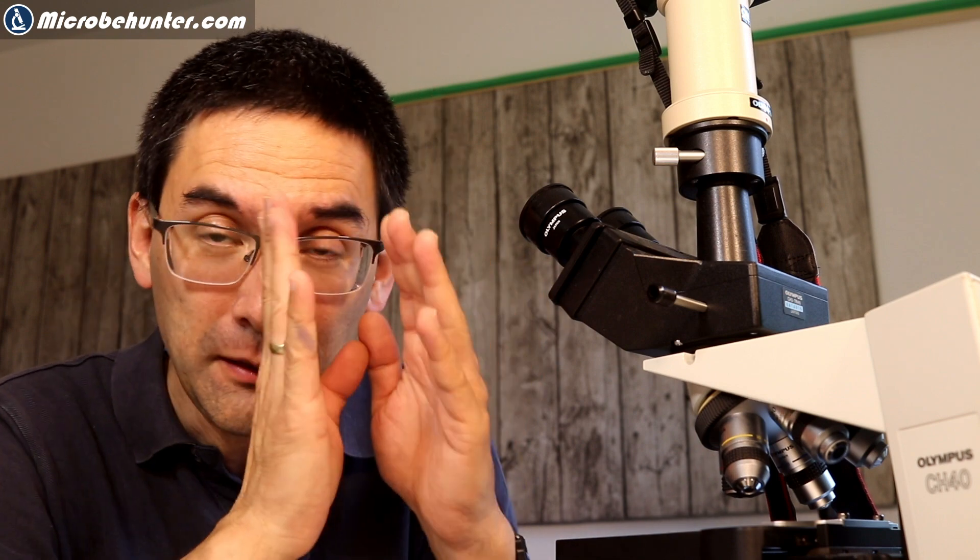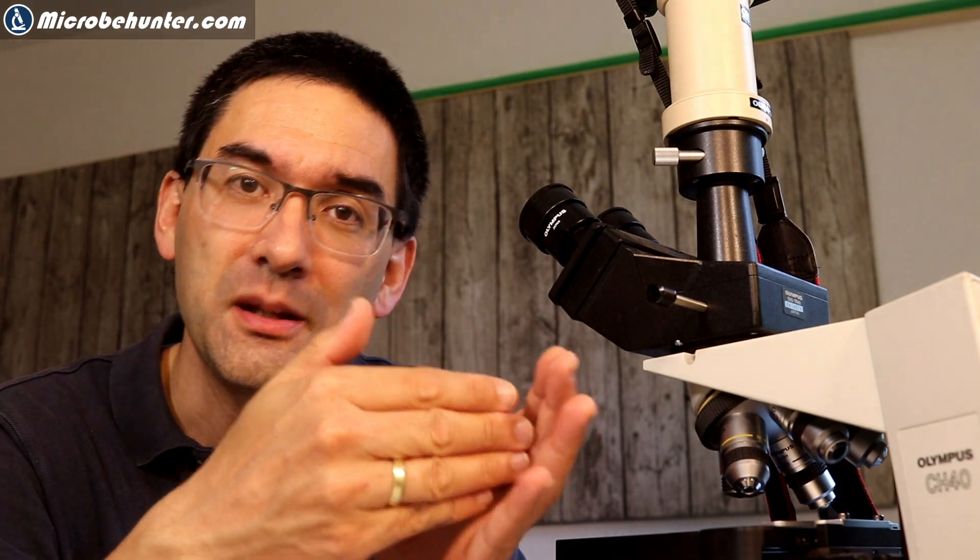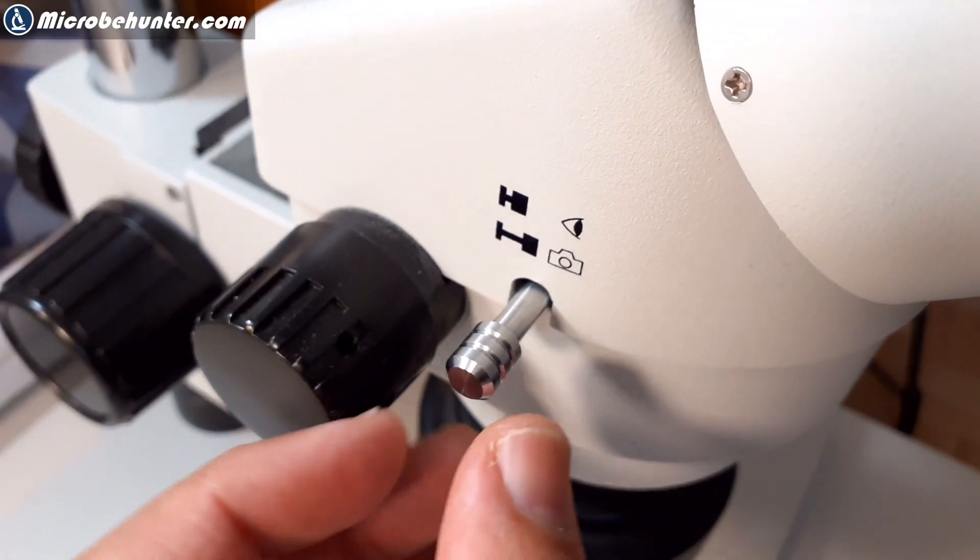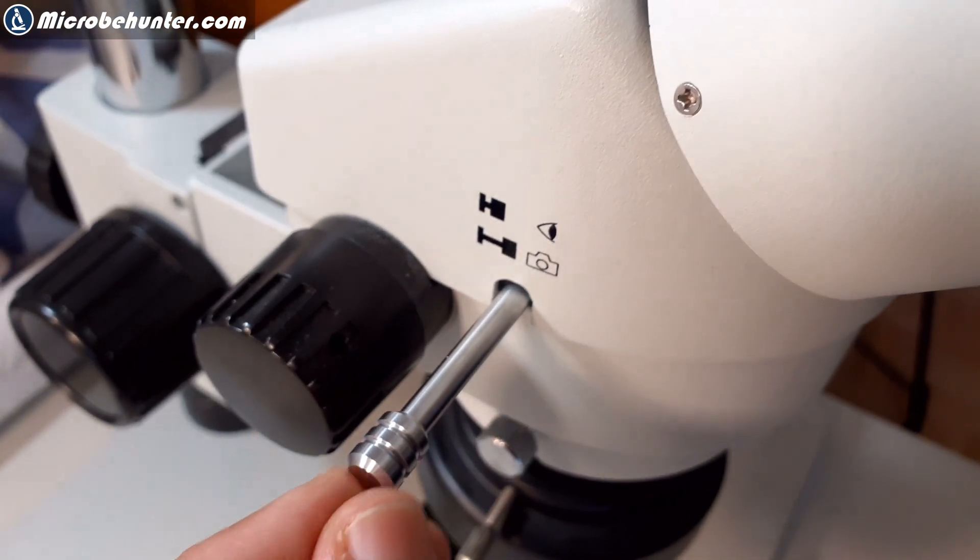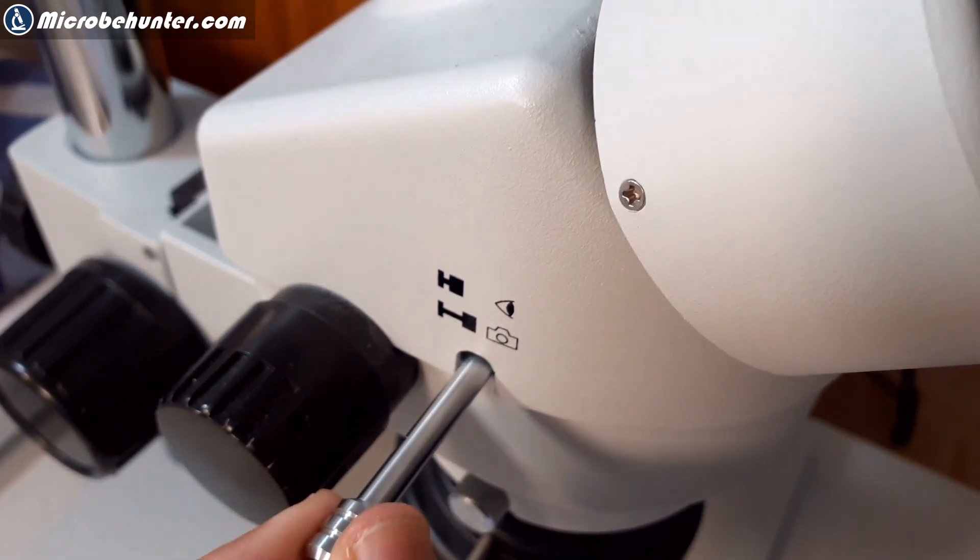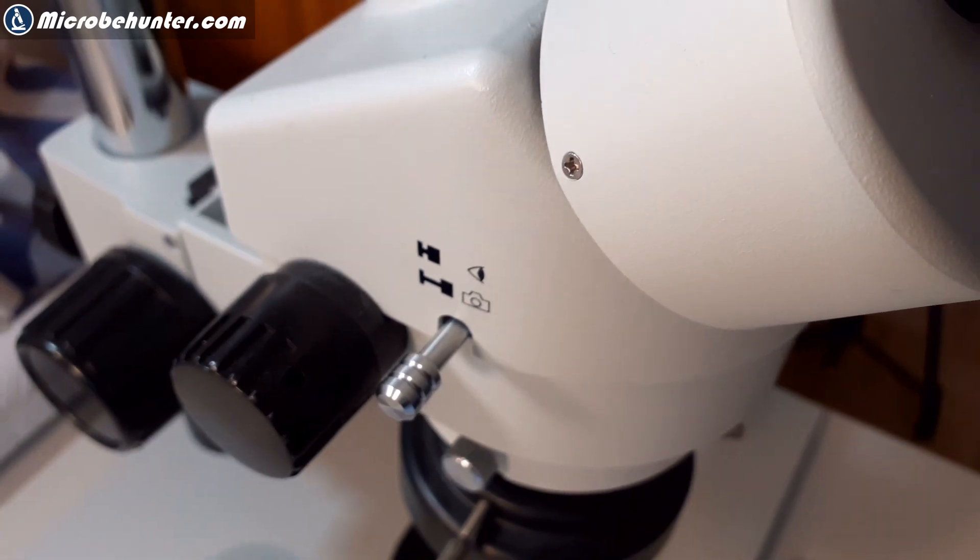What I also have is I also have a stereo microscope and in the stereo microscope I have a similar lever that can be pushed in and pulled out and here one of the eyepieces, all of the light is redirected to the camera. So that means if I'm ready to take a picture and if I switch over the lever then one eye will be completely dark and the other one will still work just as normal, but there is a mirror that is pulled into the light path and this will redirect all of the light of one eyepiece to the camera.